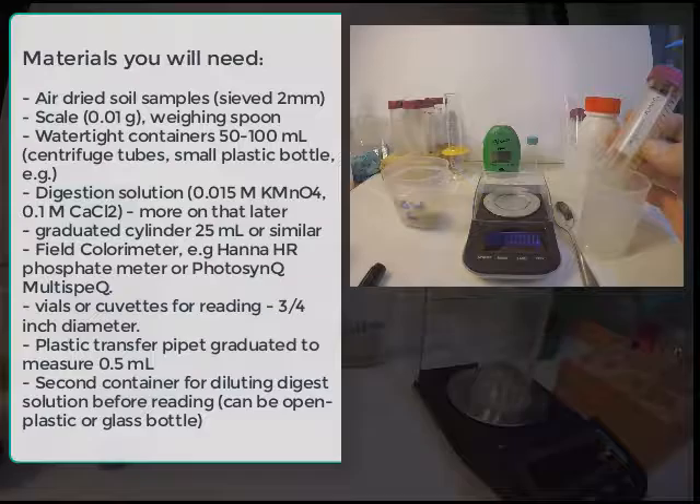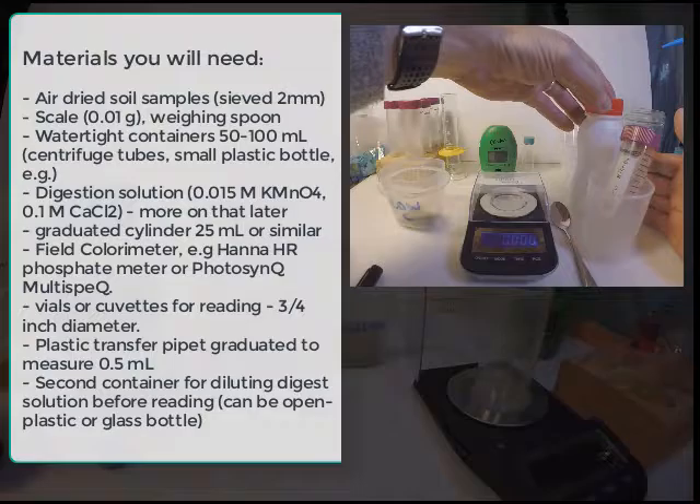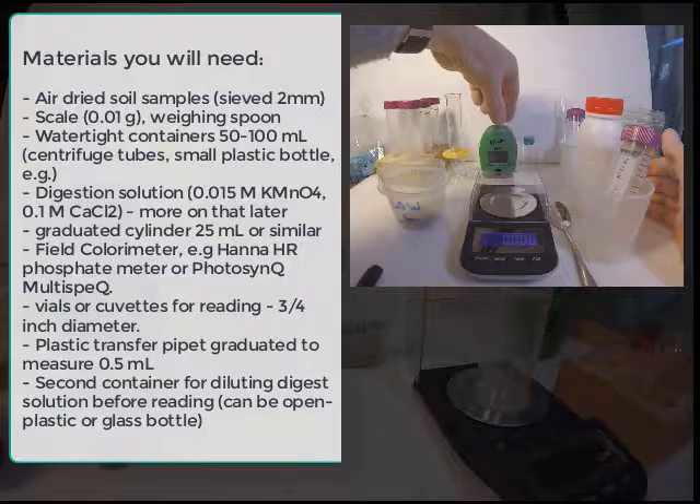We also need some sort of container where we're going to digest the soil with the permanganate solution — a digestion tube. This can also be replaced with another plastic container found in the marketplace. The all-important thing is the digestion solution, which has permanganate and calcium chloride in it. Here is a 25 ml graduated cylinder, very helpful for measuring out solution.